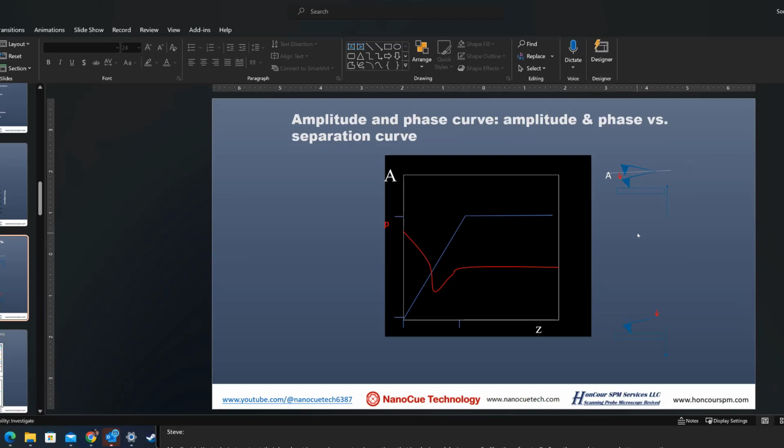It's very visual, but I have never seen any way to measure this water layer. I think there is a way to do that, but I don't remember anybody having measured a contact mode force curve in UHV, ultra-high vacuum. In UHV, if this adhesion force is caused by a water layer, there should be absolutely no attractive force or pull-off force. That's one of the things we could do to test this theory.